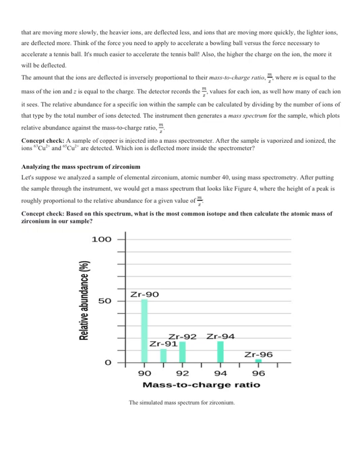What you'll see in a mass spectrometry problem is these little spikes on this graph, and each of the spikes is a different isotope. So this one right here is the zirconium-90 isotope. This is zirconium-94. This is 96. And if you look at these isotopes, what is similar about all of them? Well, if they're all the element zirconium, they all have the same number of protons.